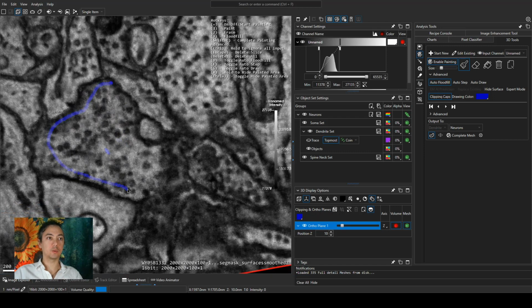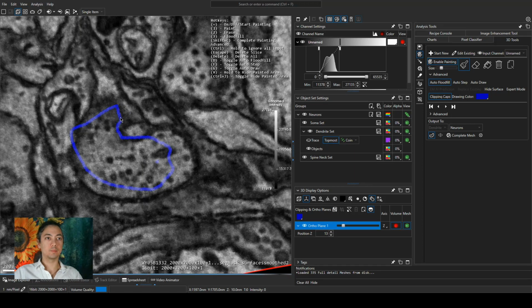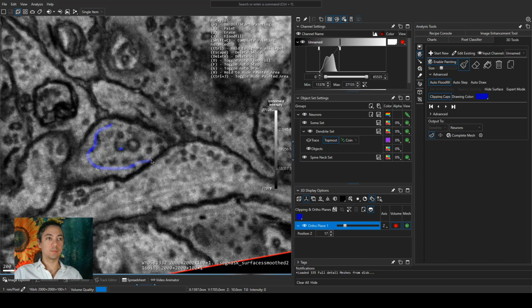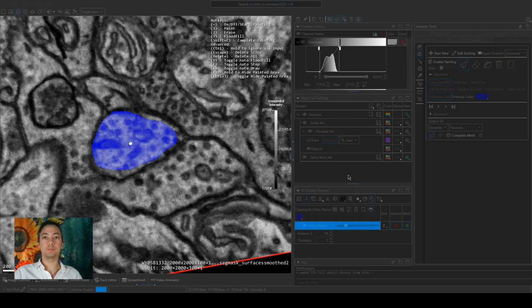We've got a lot to go, so we're going to go a little bit faster. Something like this. Oh, yeah, that's okay. We can make one more. It doesn't matter. So that's a good point. Anything you paint will now be associated to whatever center line, even if it doesn't exactly lie on the same z-plane or fit the same shape. It's up to you to draw as you wish.